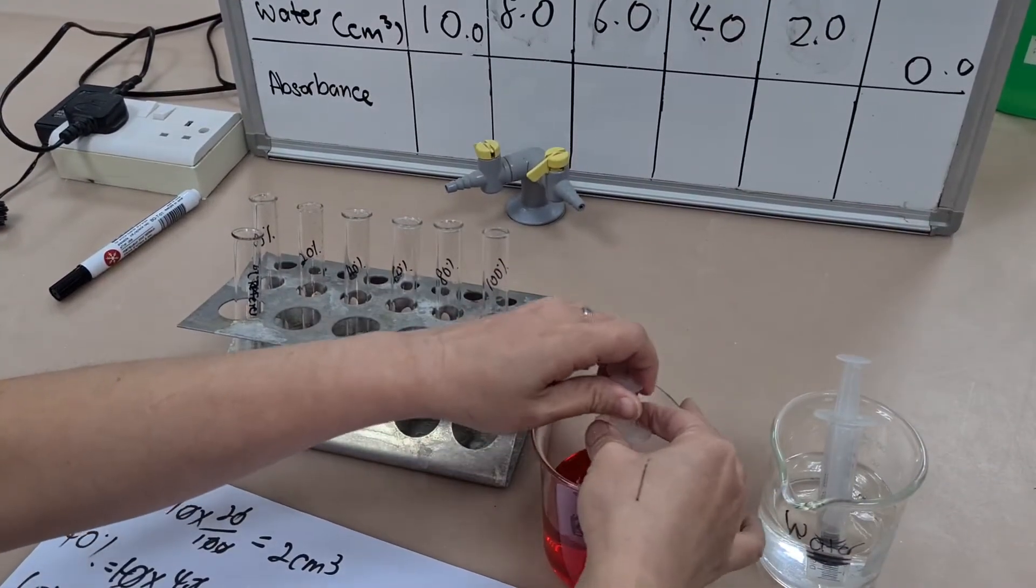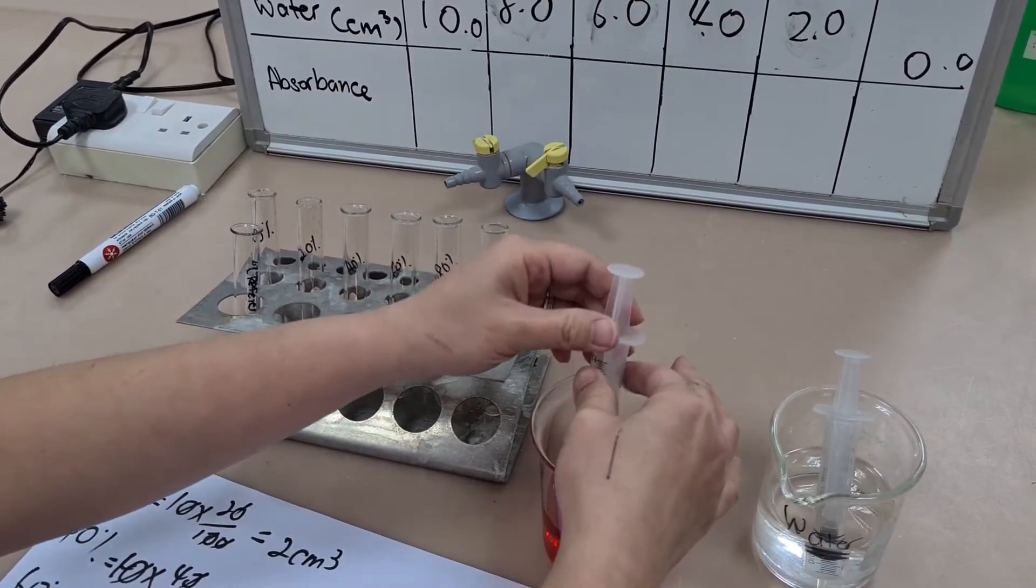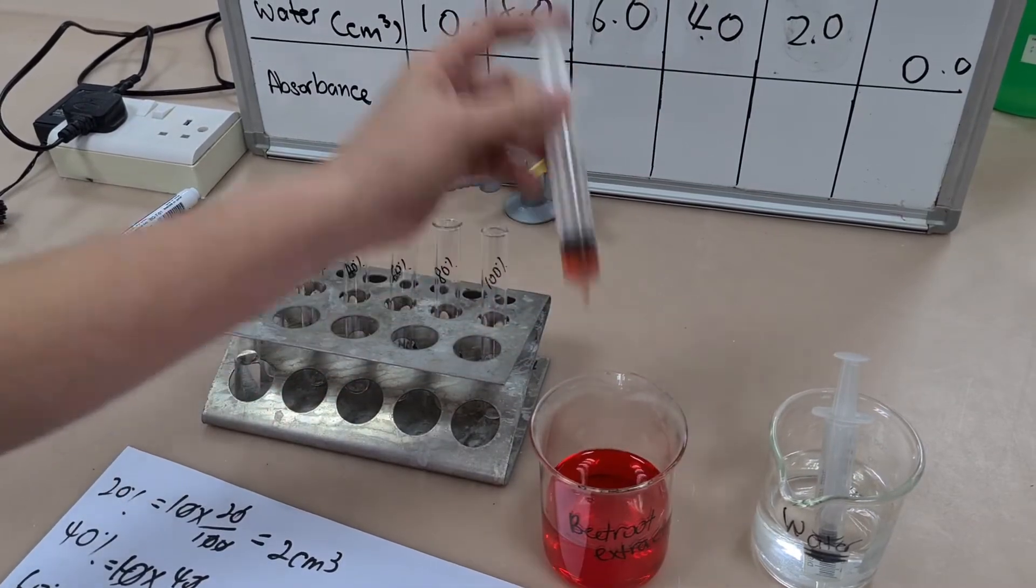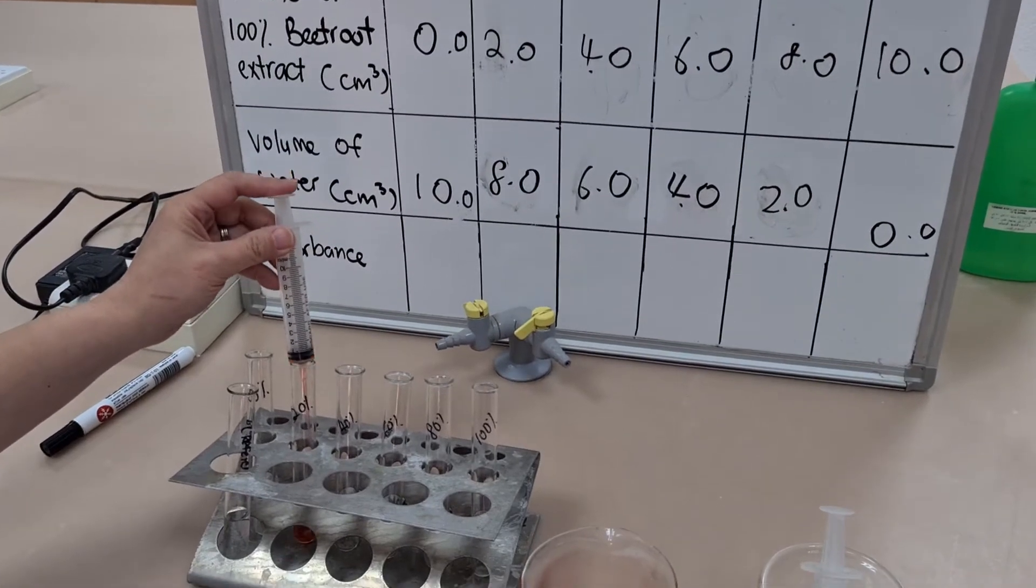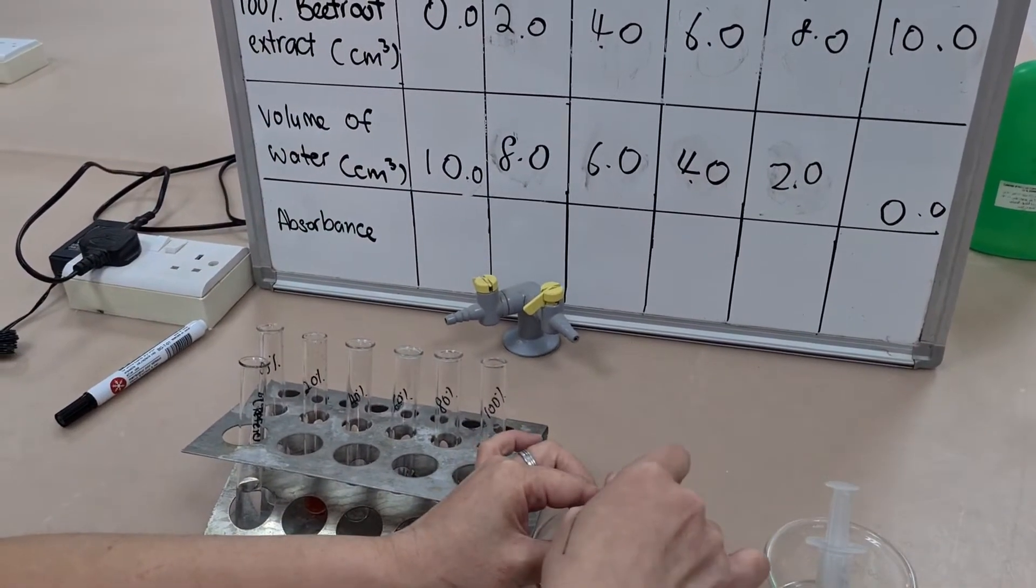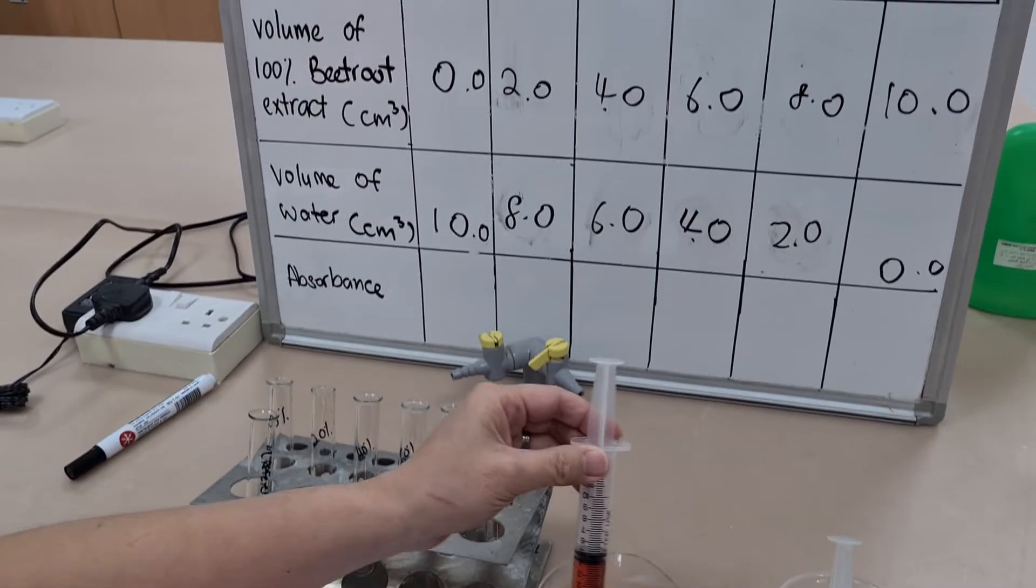We'll make six dilutions. We always need at least five because if we're going to plot anything on a graph, we need at least five data points. And I'm going to make 10 mils of each dilution.